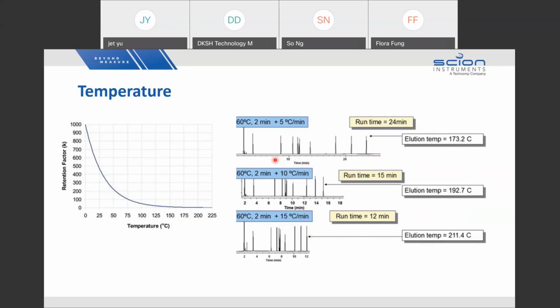But some of you may think, why not we start from here? Yes, there's a spacing here. However, once you change the temperature conditions over here, you are able to affect the rest. So you think about this. But here you look at this. These are a few peaks, no issues. You look at these 2 peaks, so it's close by.